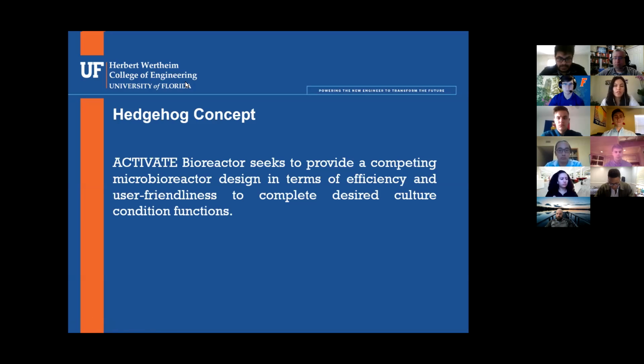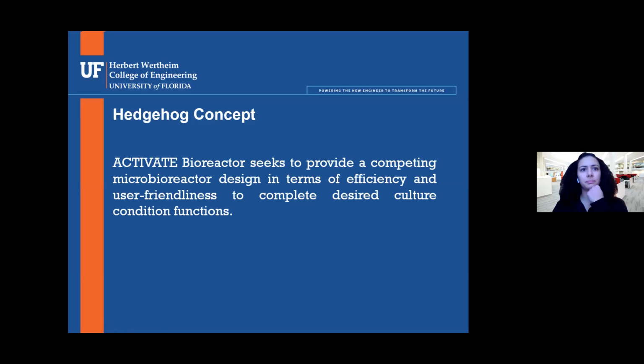So a challenge for our team was determining how to stand out against competing designs with a concept that mirrored our values. So with continued concept generation and design, we found that we were interested in making a design that was efficient in terms of function and user friendliness, especially when it came to complex bioengineering technologies such as bioreactors. So Activate Bioreactor seeks to provide a competing solution to autonomous bioreactors in this field.